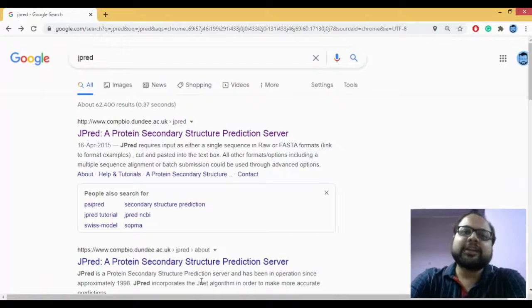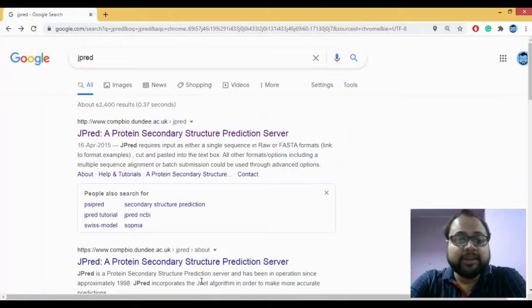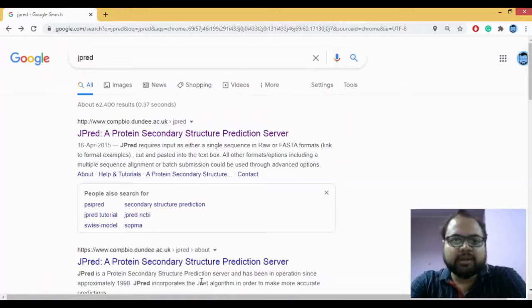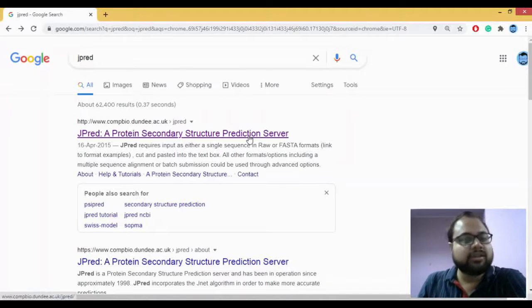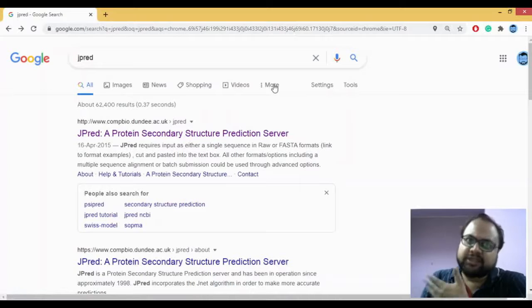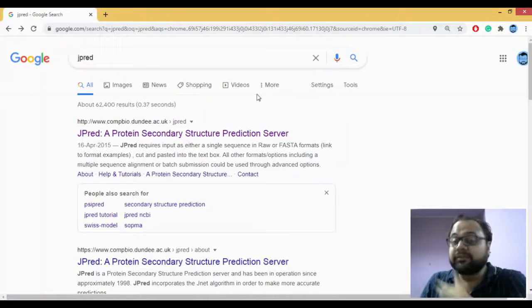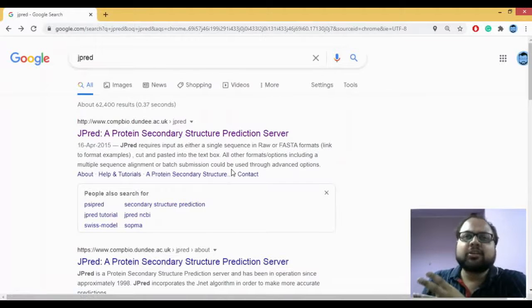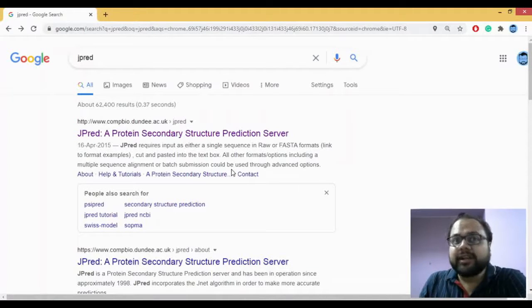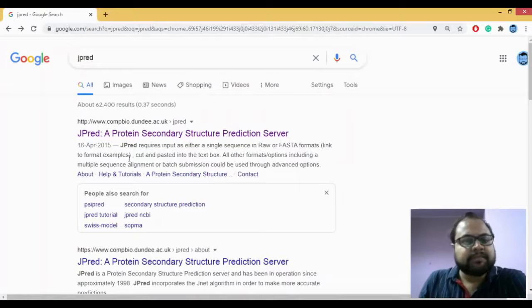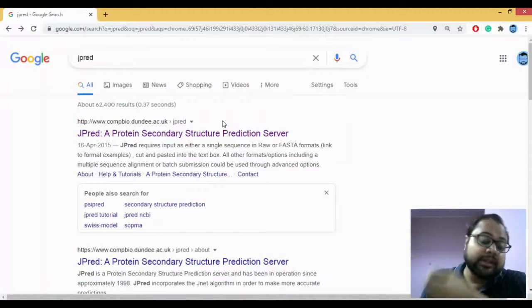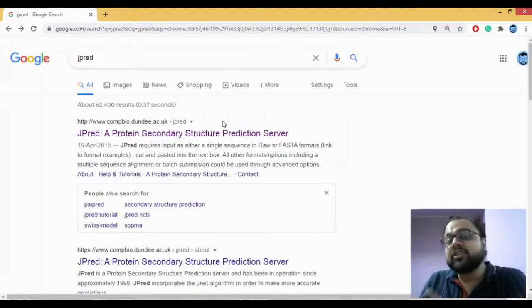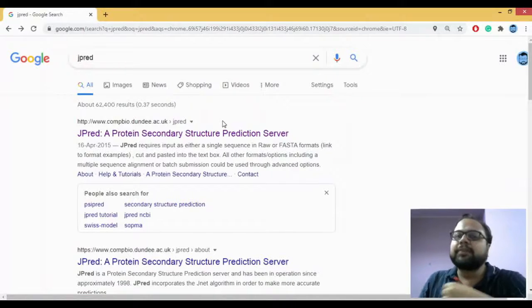JPred is essentially a protein secondary structure prediction server. It was first developed in 1998. JPred incorporates something called the JNet algorithm, and because it incorporates the JNet algorithm, its predictions are much more accurate compared to Chou-Fasman as well as the GOR method.